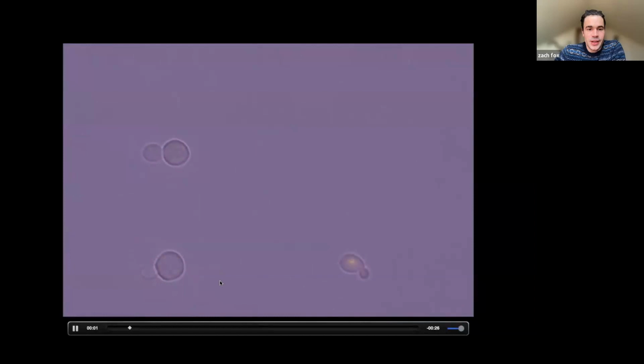Okay, and then finally, we implemented the single cell control in real cells. Here I'm going to show a video from one of the experiments. You're going to watch the cells growing and dividing, that's the purple color, and then you'll see flashes of yellow. Those flashes of yellow indicate the signal being applied to those cells. And then we'll look at the results afterwards. So let's take a look.